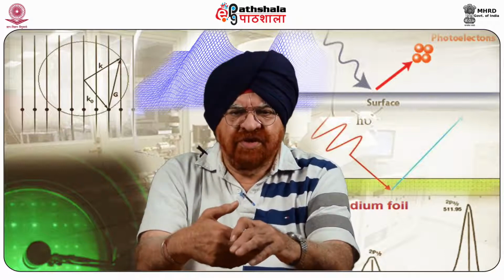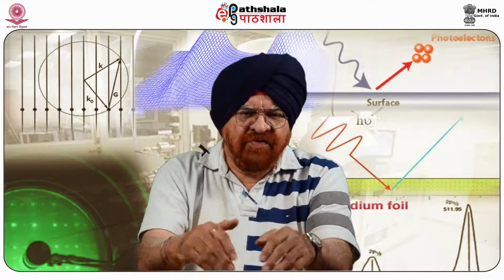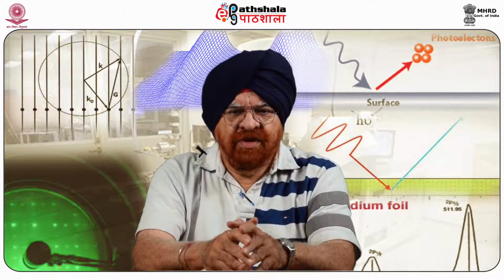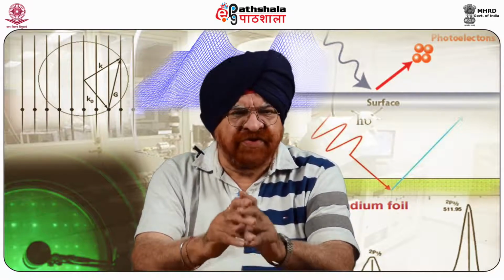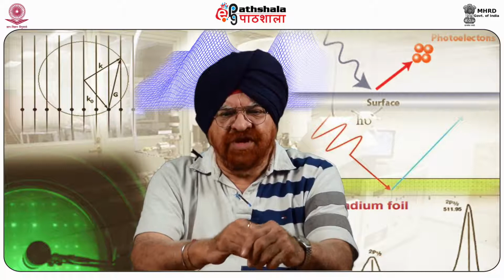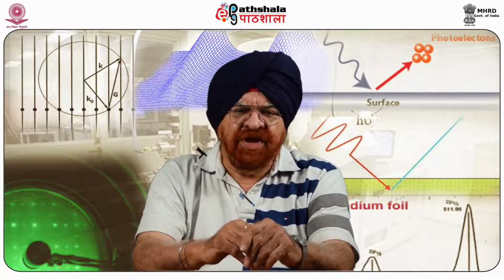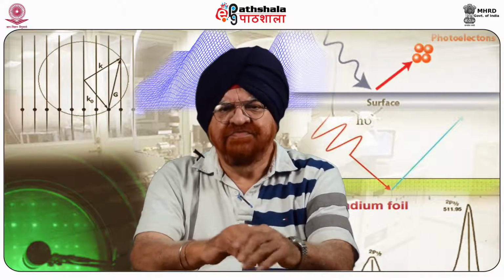If we try to know how the CPD and LCPD correspond to physical properties of the surface, KPFM has enabled the experimental determination of quantum size effects on the electronic properties of metallic nanostructures, which otherwise has not been possible.